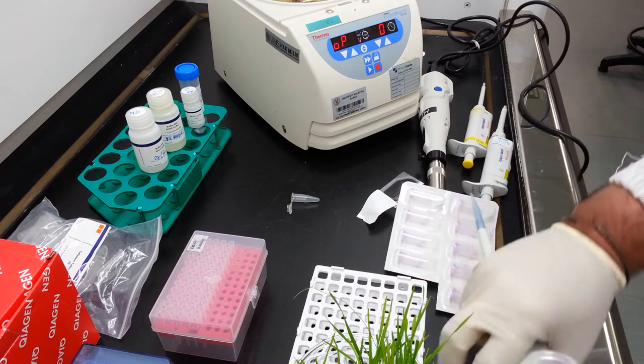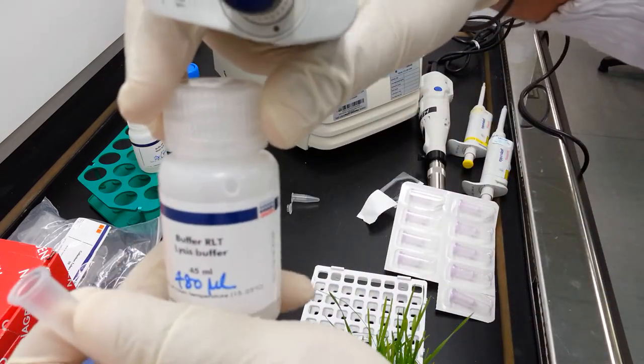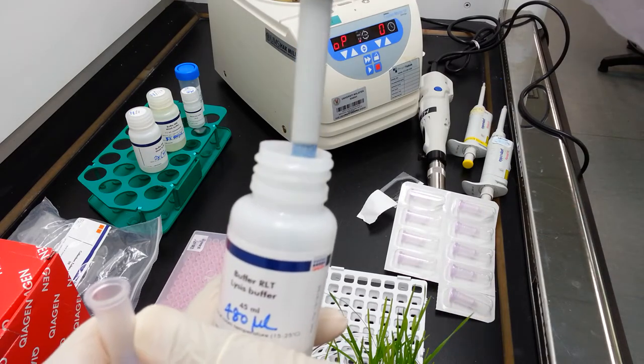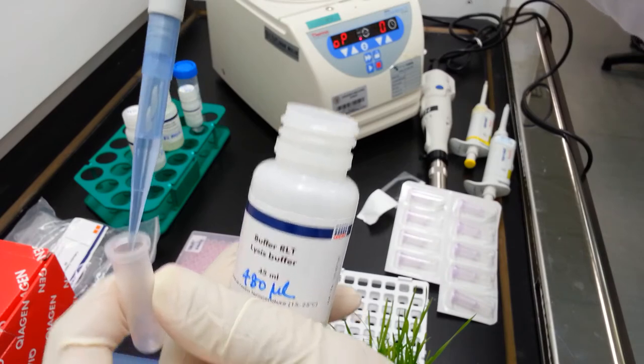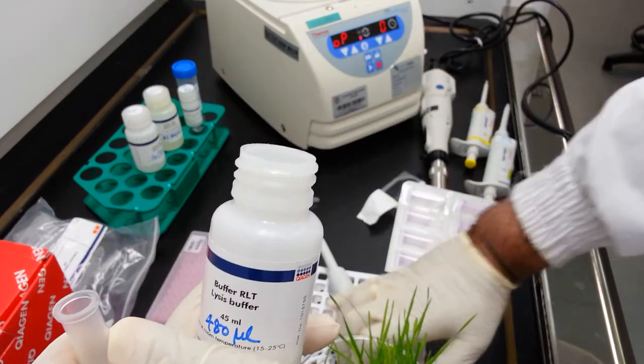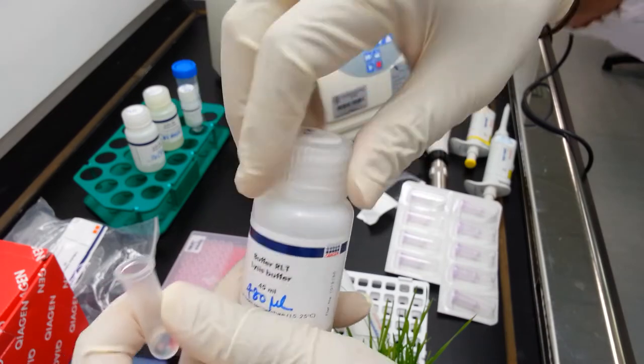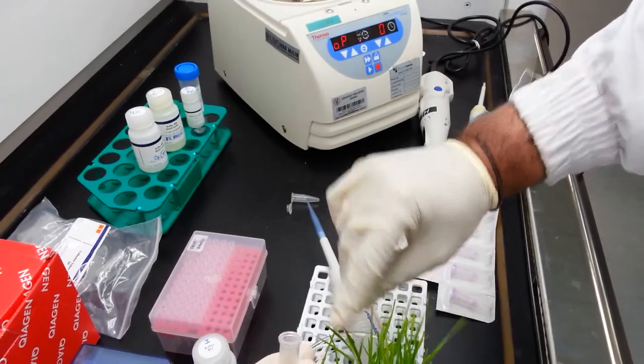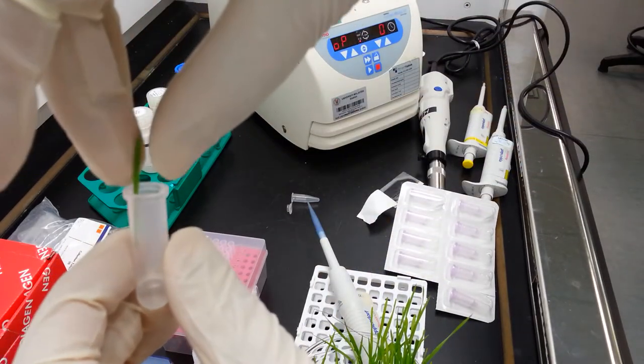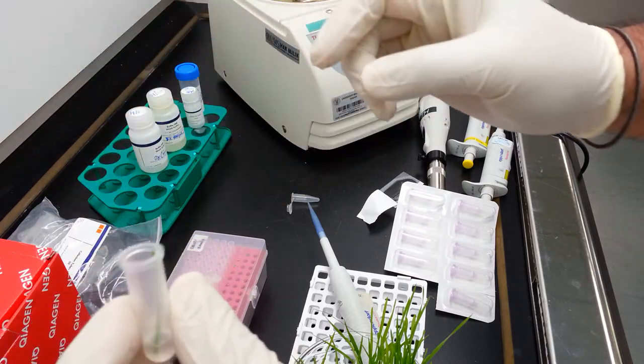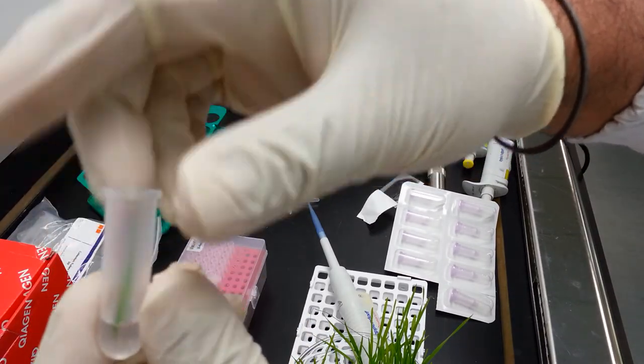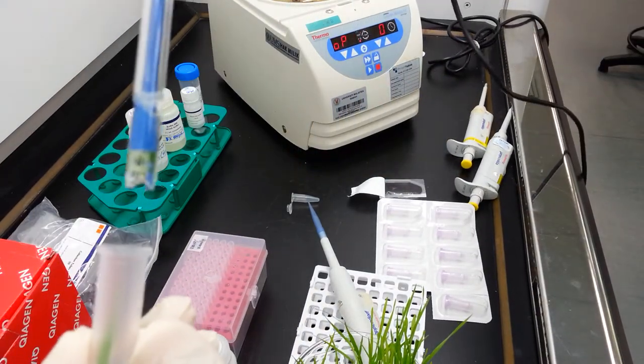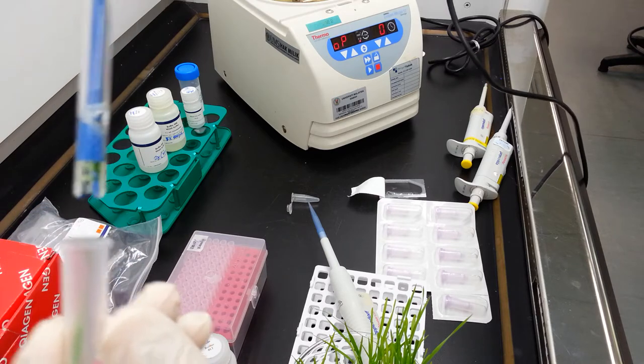To begin, transfer 480 microliters of buffer RLT into a tube. You may transfer a small section of your tissue sample into this tube. Homogenization of the sample tissue can be done using a warring blender or a homogenizer. In this case, we will be using a motorized blender.